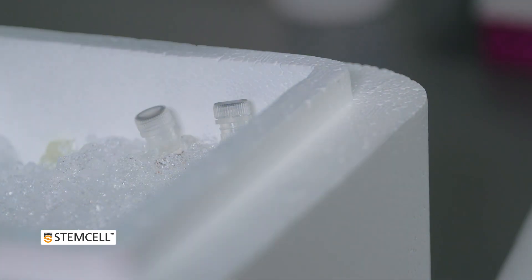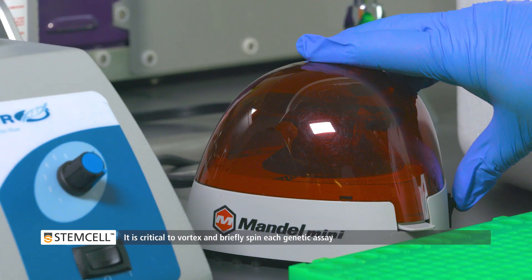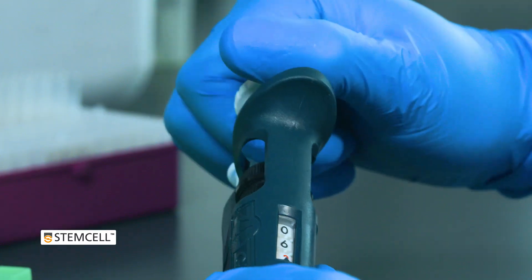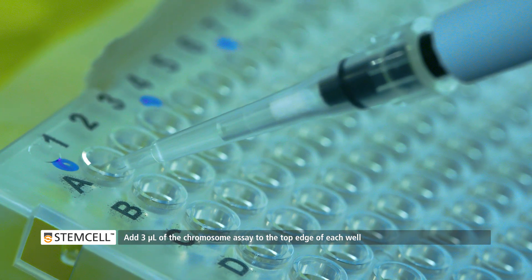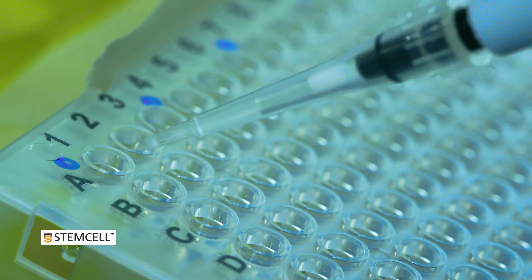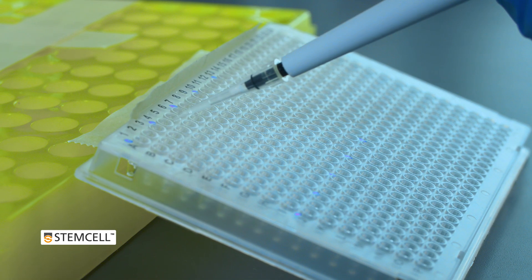Next, take each genetic assay in turn. Vortex thoroughly and spin the contents briefly. Using a manual or multi-dispense pipet, add 3 microliters of the genetic assay to the top edge of each well in the respective plate rows. Repeat with each genetic assay until all 9 have been loaded onto the plate.